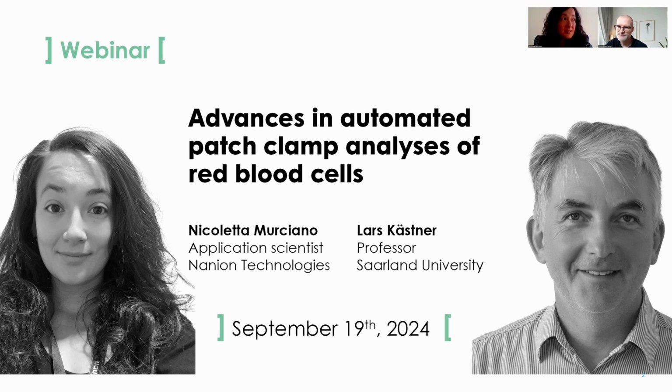What I can say about the size of the cells: erythroblasts were smaller than what we expected. They were very similar to red blood cell size. And that's why I always use the same chip, same hole size for all the experiments. So that's why I didn't perform current density, so any normalization. And Gardos was only the result of the blocker addition. So I didn't investigate Gardos activation directly. So no current density.